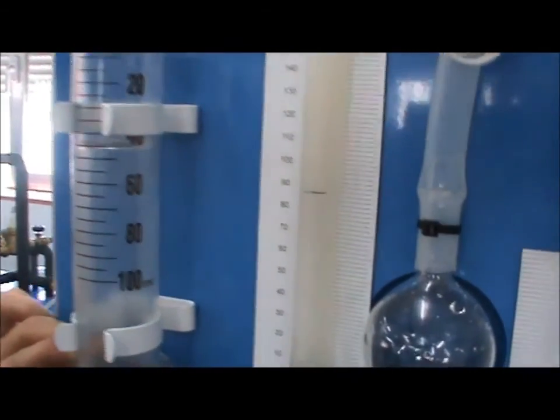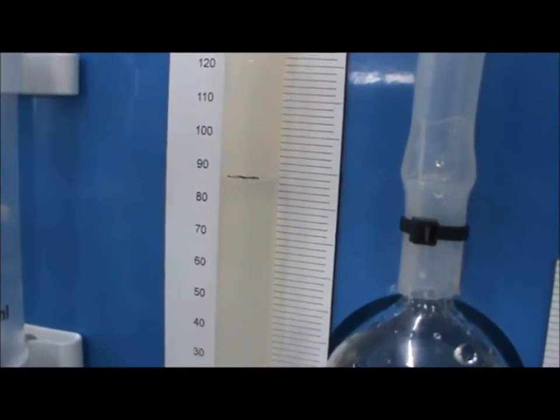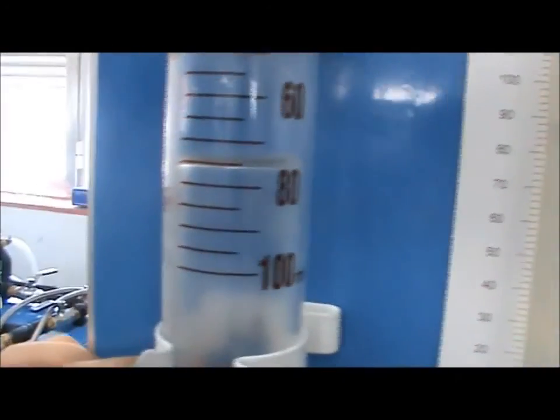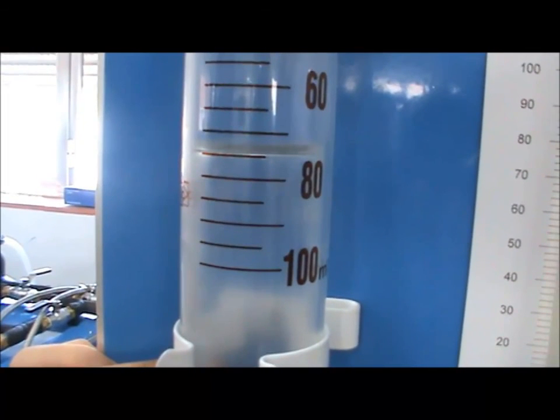Pull the plunger down to bring the solution to the marked level, and carefully measure the value shown on the syringe. In this experiment, the KOH solution absorbed 25 milliliters of CO2.